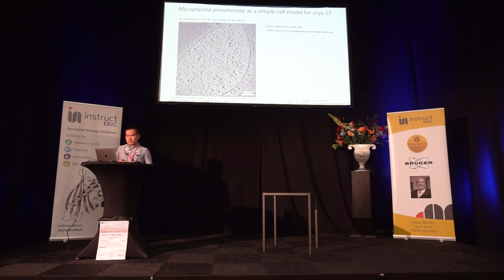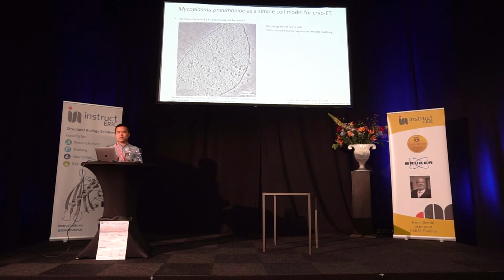Also, because we don't need to do FIB milling, this enabled us to collect quite large cryo-ET datasets of hundreds of high-quality tomograms. And also using template matching, I managed to pick about 100,000 ribosome sub-tomograms or 3D particles from it.